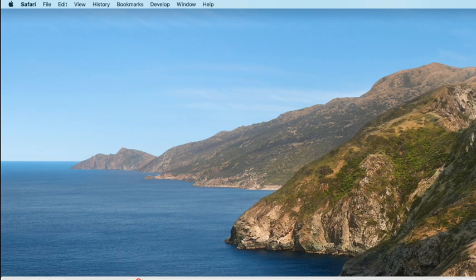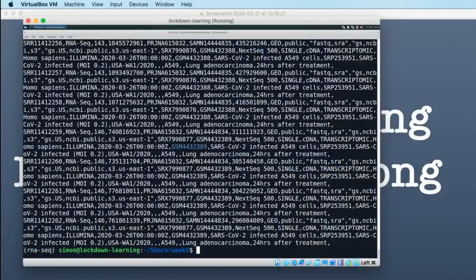Anyway, I was just drawing a NextSeq flow cell. I do actually have one in my office, but my office is inaccessible to me at the moment, so there's not a lot I can do about that. But I just wanted to outline the reasons for why we're trying to deal with this configuration of 4 files per sample.